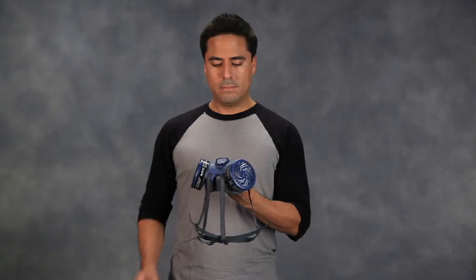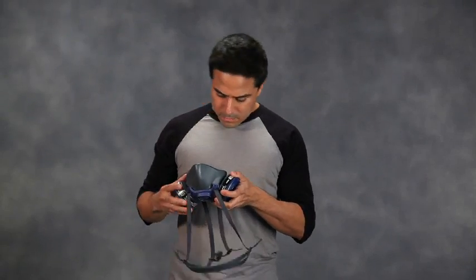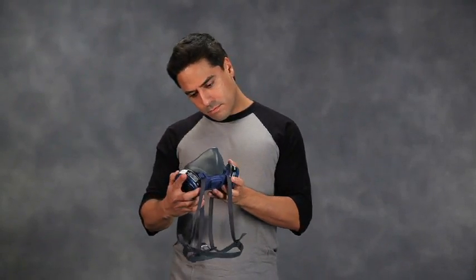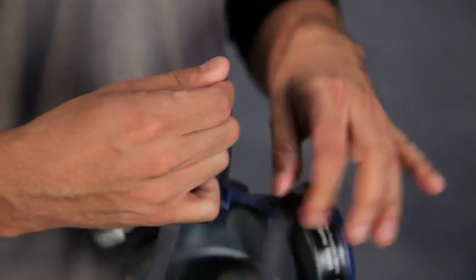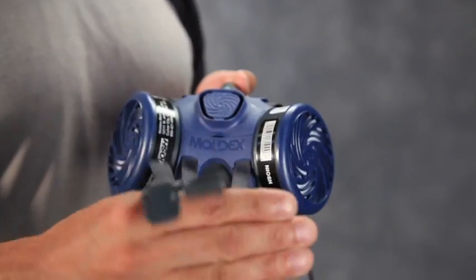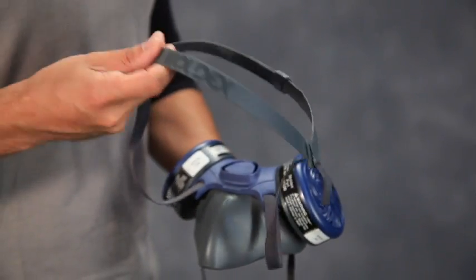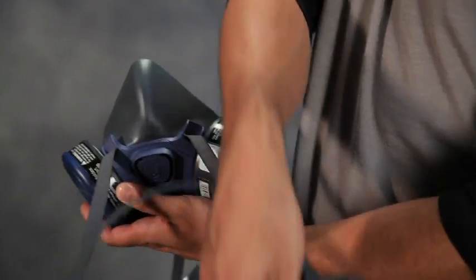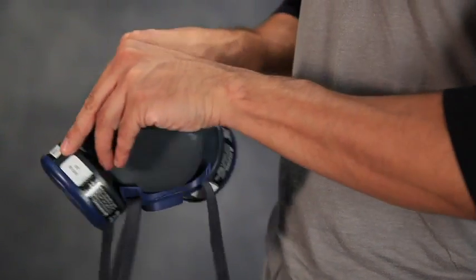It is important that you inspect your respirator before and after each use. Do not wear it and return to your supervisor if head straps are torn, cut, or have lost elasticity; buckles or head cradle are missing, damaged, or broken; or face piece is cracked, torn, distorted, dirty, or has holes.